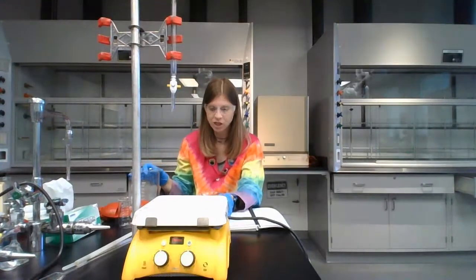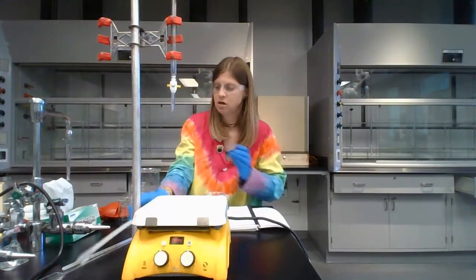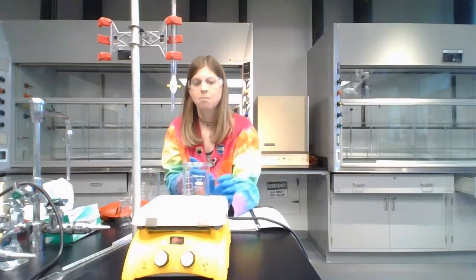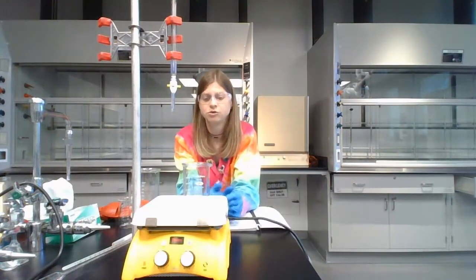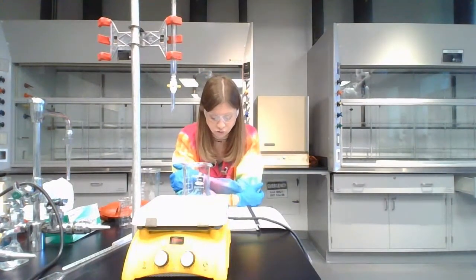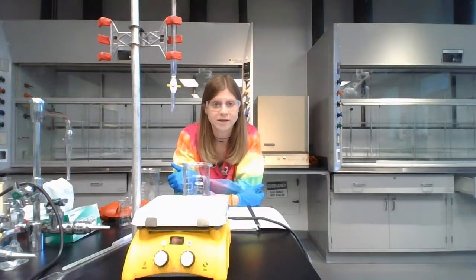Okay. So you'll need to check out your stir bar, and then add that to your beaker. Now, before the reaction can start, the solutions inside the beaker need to get to at least 70 degrees Celsius. So the solutions need to be between 70 and 90 degrees Celsius. We don't want them to boil, so don't let it get warmer than 90.